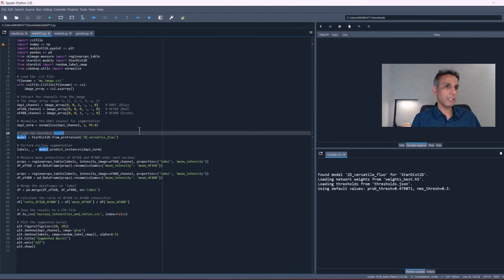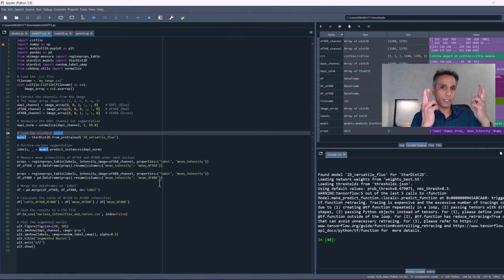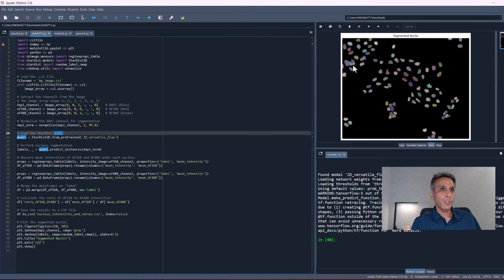Okay, so similar screen and no warning about normalize and no errors. I have my fingers crossed. Okay, so, oh, that's amazing. You see how amazing the segmentation is. Do we get 107? Because we are using exactly the same Stardist model for segmentation, our results should be reproducible.